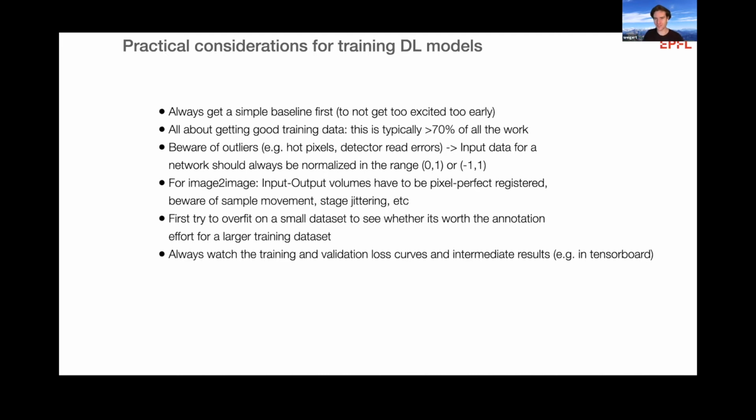If your data set consists of 80% easy cases, then it's not worth annotating all of the easy cases when you then don't have any motivation left when it comes to the hard cases. And that's just my recommendation.